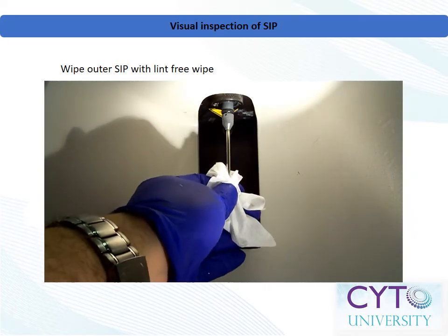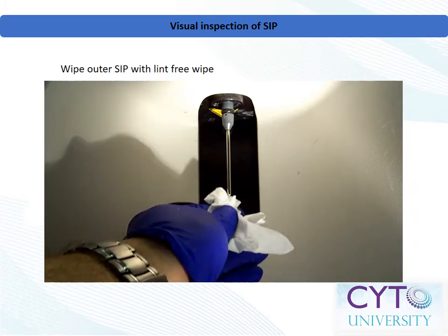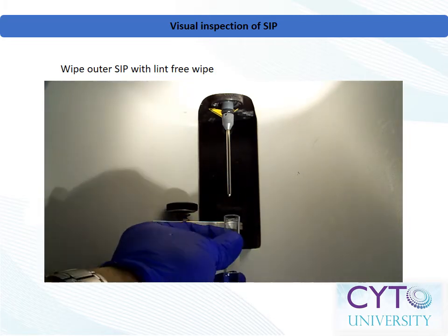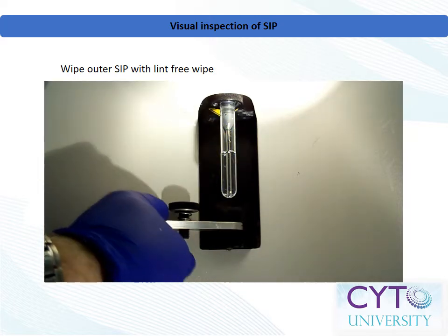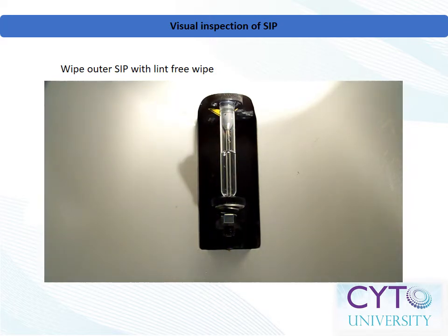Once you have verified that the cytometer presents as all systems normal, the next place to look for an easy unclogging solution is to visually inspect the sample injection port. Some systems have a rigid metal tube which interacts with the sample, while others use plastic. The sample injection port for many systems includes an outer and inner tube, where the outer tube has a cross-shaped opening that can sometimes trap larger aggregates of cells before they enter into the inner tube. This outer tube can easily be cleared by wiping with a lint-free absorbent wipe.